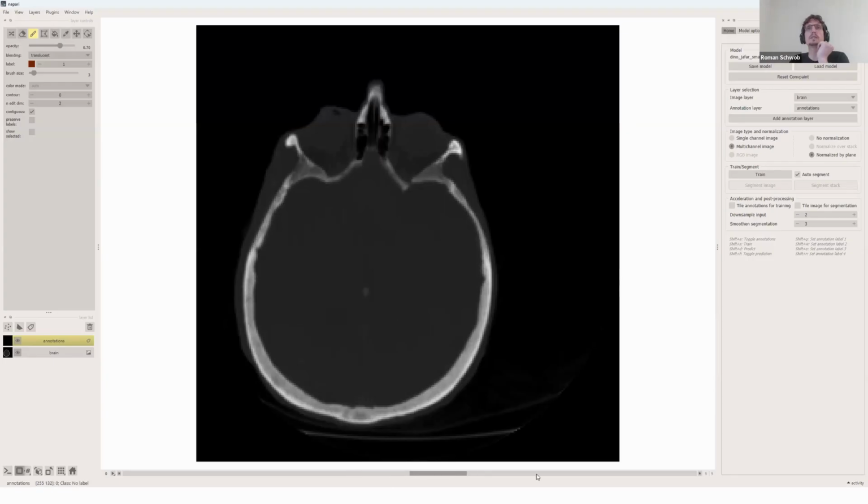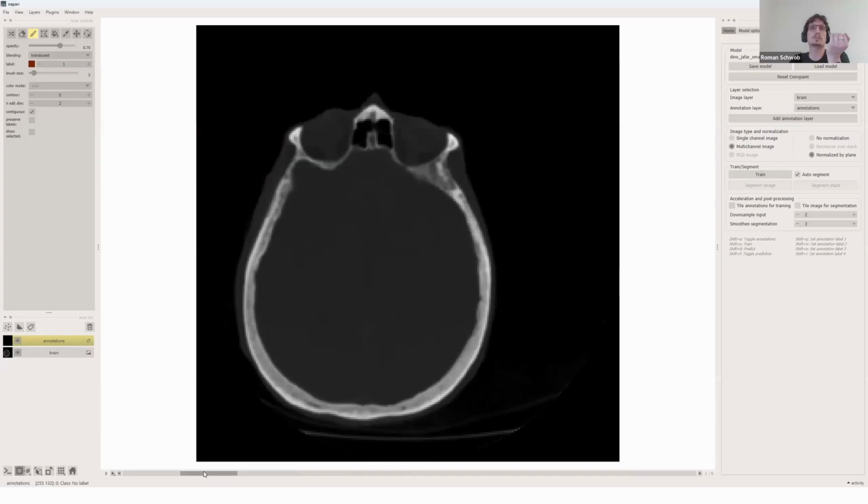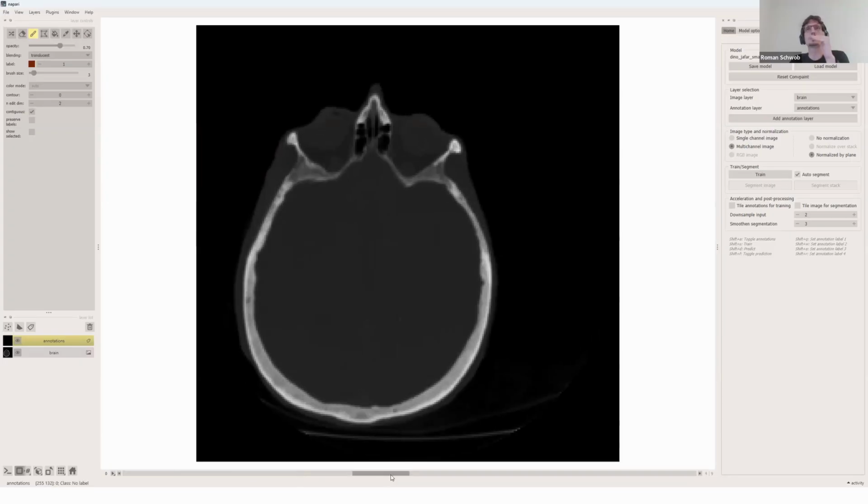If we expect the image, this is really just a 3D image where the third dimension represents a spatial dimension, right? So we want to treat this third dimension as kind of independent, or like a stack of 2D planes.